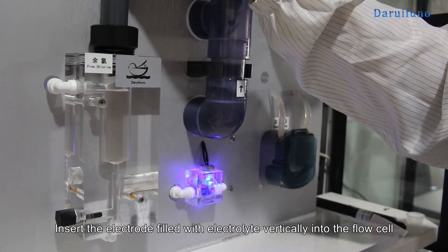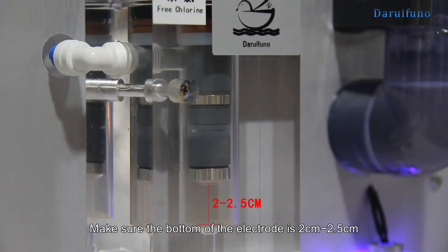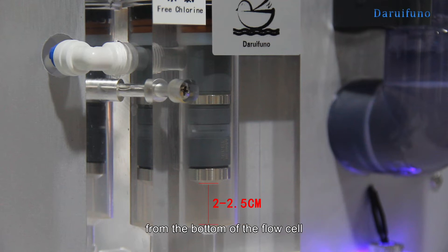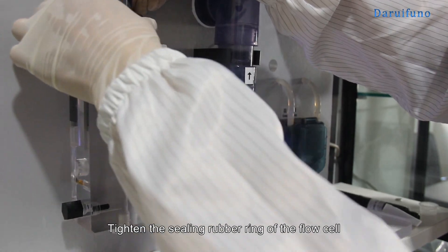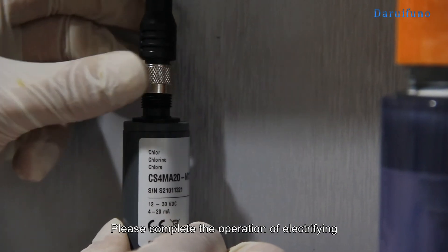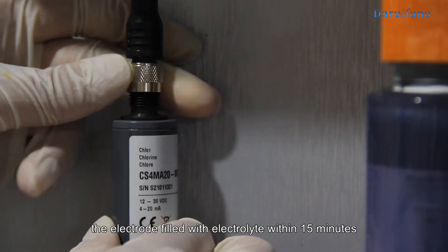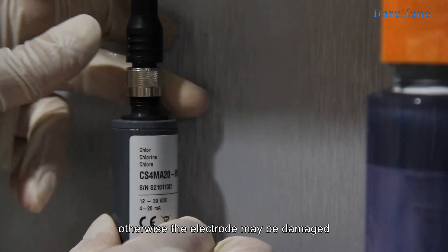Insert the electrode filled with electrolyte vertically into the flow cell. Make sure the bottom of the electrode is 2 cm to 2.5 cm from the bottom of the flow cell. Tighten the sealing rubber ring of the flow cell and turn on the water and electricity for hydration. Please complete the operation of electrifying the electrode filled with electrolyte within 15 minutes; otherwise the electrode may be damaged.